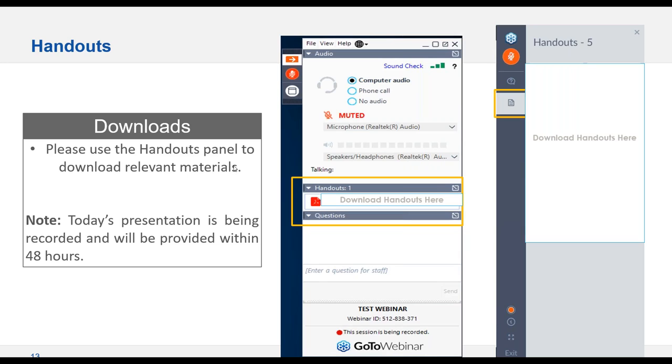One question is, how closely should I be matching my acid concentrations in my samples and standards? My rule of thumb is I like to be within 1 or 2%. I've seen some pretty drastic things occur if I make my calibration standards, let's say, in 1% nitric acid, and my samples have 5% nitric acid, and vice versa. So you want to get as close as you can be. Generally, if you're matching within 1 or 2%, those differences are somewhat negligible.